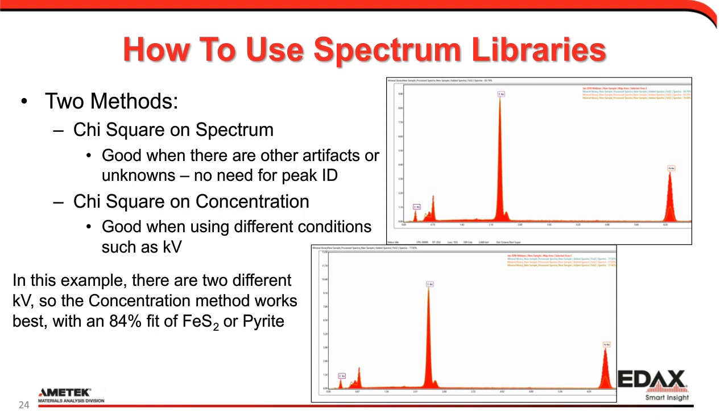Another good one. Two questions. First, can this technique be combined with SEM EBSD in the area which you are interested in? And yes, it can. Boy, that would be a great next step in the analysis, wouldn't it? So we can see the phase, or what we consider, in a multi-phase sample, I'm talking about grains and phases or compounds.